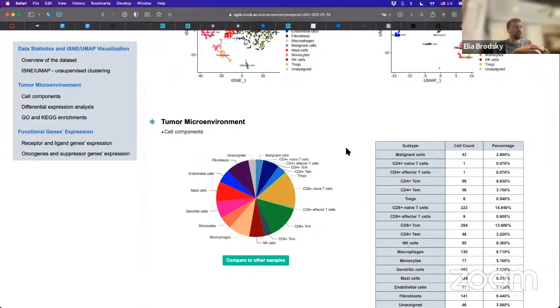Typically, it has a lot of immune cells, right? So when something like that happens, the natural reaction of the organism is to address it by putting there the offensive, right? And saying, let's first of all quarantine this little place, and then let's kill them. And so you see here T cells, you can see here macrophages and other kinds of cells, right? And specifically, you can see here, if you click right here, that there's about 3% of malignant cells, right?